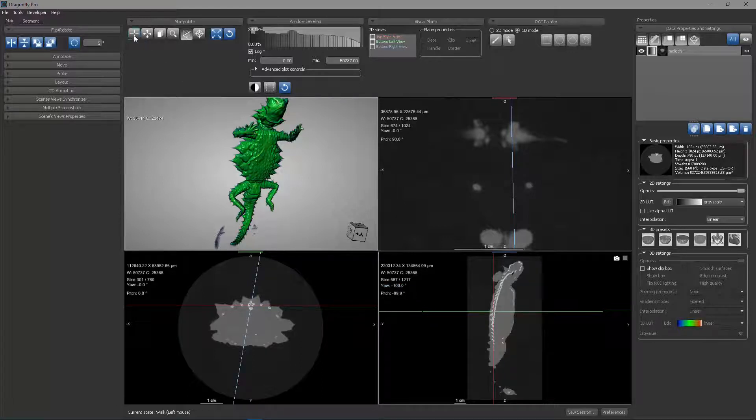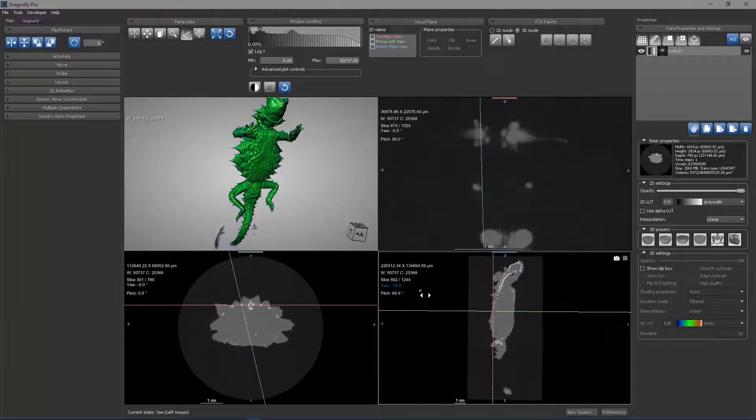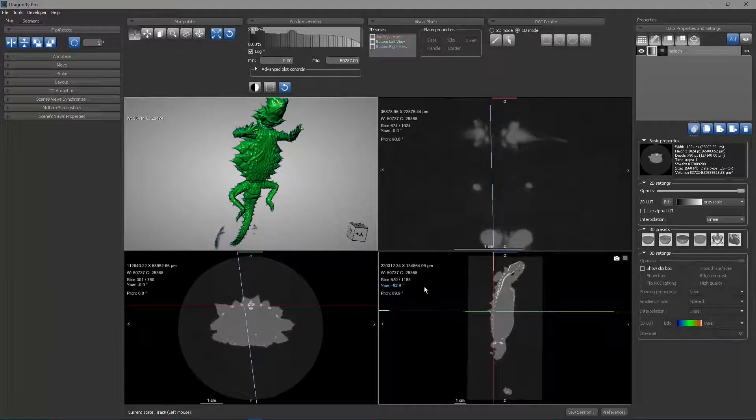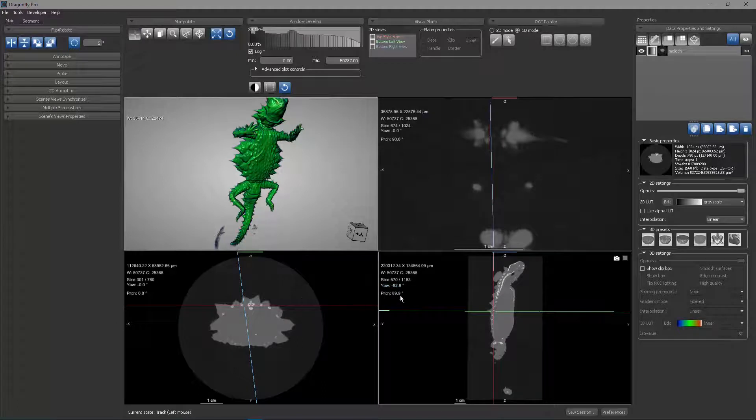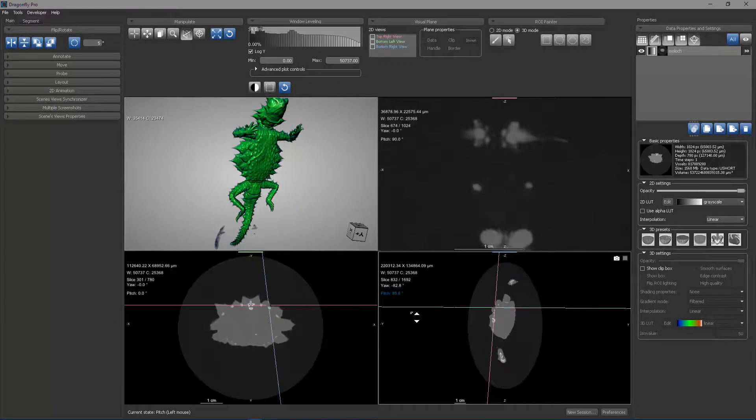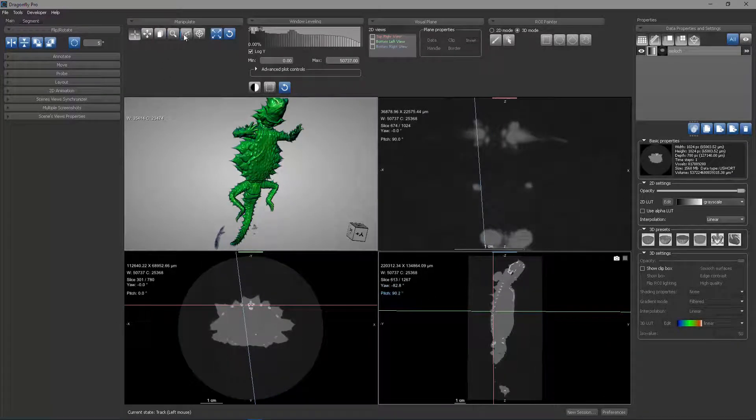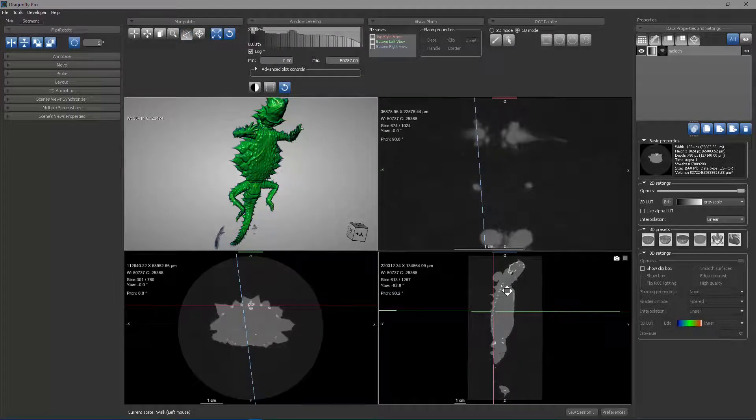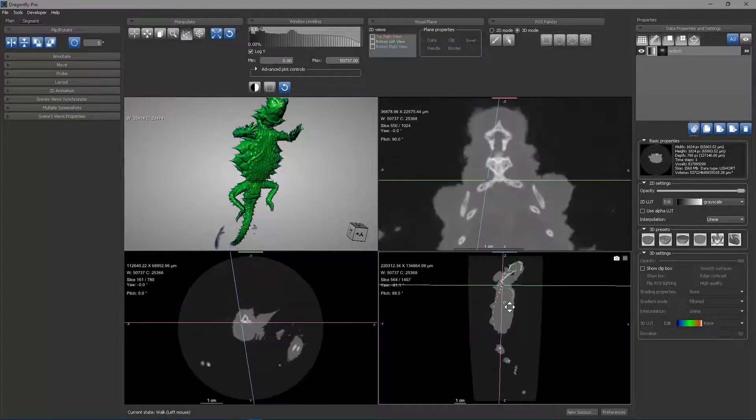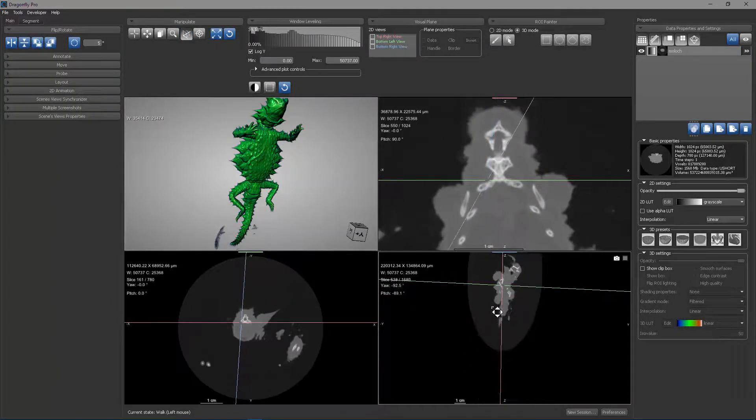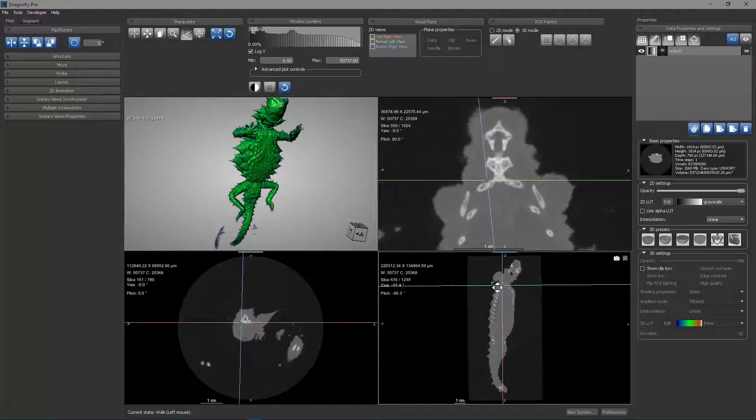This is similar to applying yaw and pitch. If I'm back in the track state, you can see that I can use these text presenters to do a yaw, and you can see the behavior of how this slice is changing over here, or a pitch, and you can see how it's changing up here. The walk button allows you to do both at the same time, and it pivots directly where the mouse is. This allows you to walk around and change the freehand view of that slice.